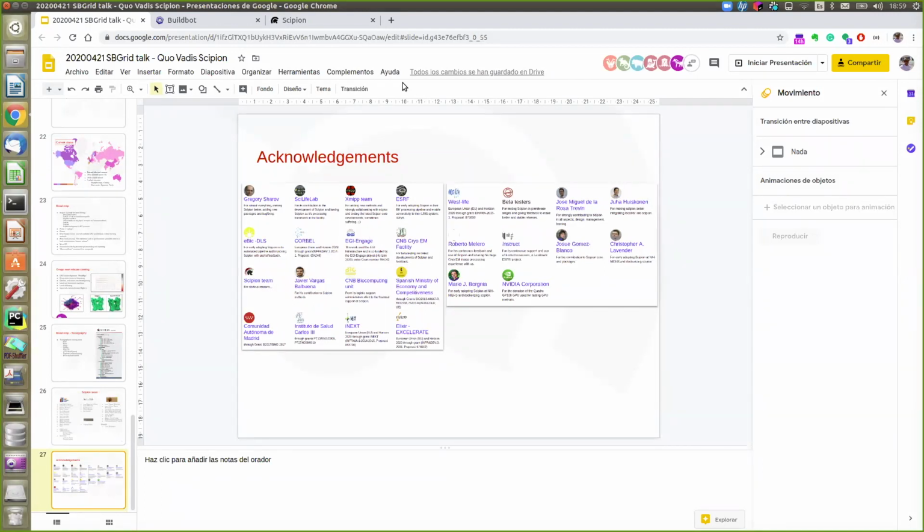Most of our developers are already on Scipion 3 using Xmipp. Jose Miguel, Grigory doing Relion stuff and maintaining other plugins. We all have migrated to Scipion 3. It's true that we are not regular users, so we just focus on code testing with some data. It's not actual processing, but we are in a stage where you can still, with some risk, use Scipion 3 in beta testing mode.